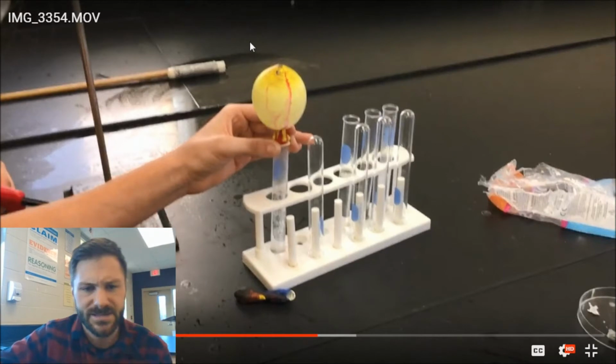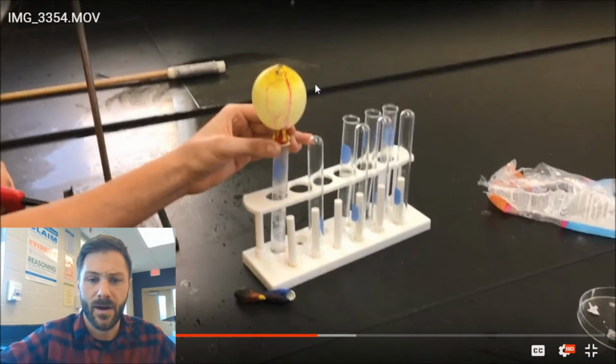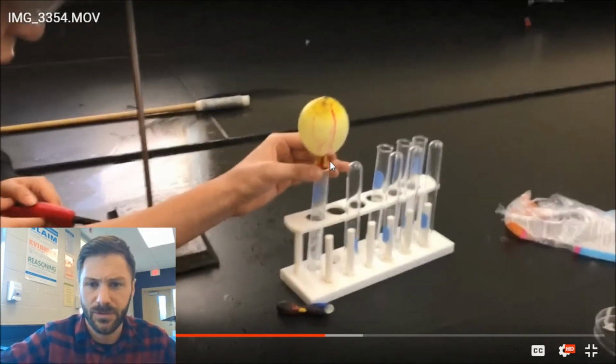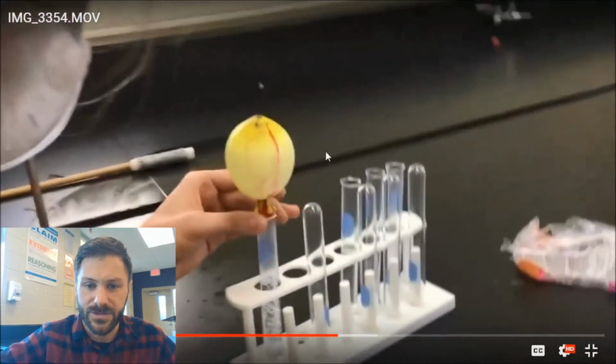So same reaction, same thing happening, same concept. They have a balloon up here. So whatever that bubbling gas is, they are capturing it in the balloon. Okay. So as we play here, they're just waiting, kind of watching the balloon gradually expanding as more and more gas comes out of this liquid here and enters the balloon.